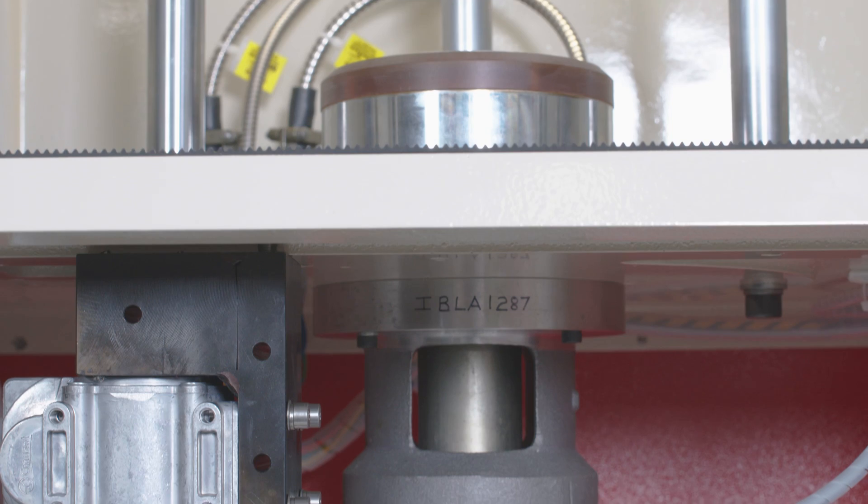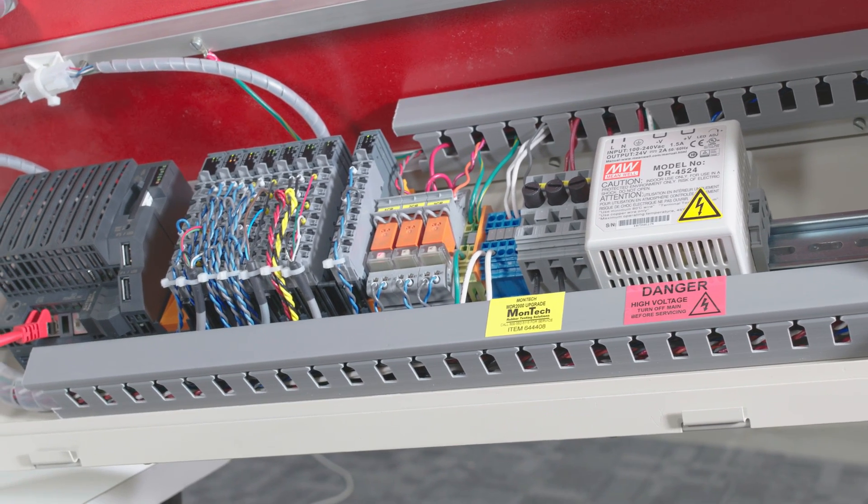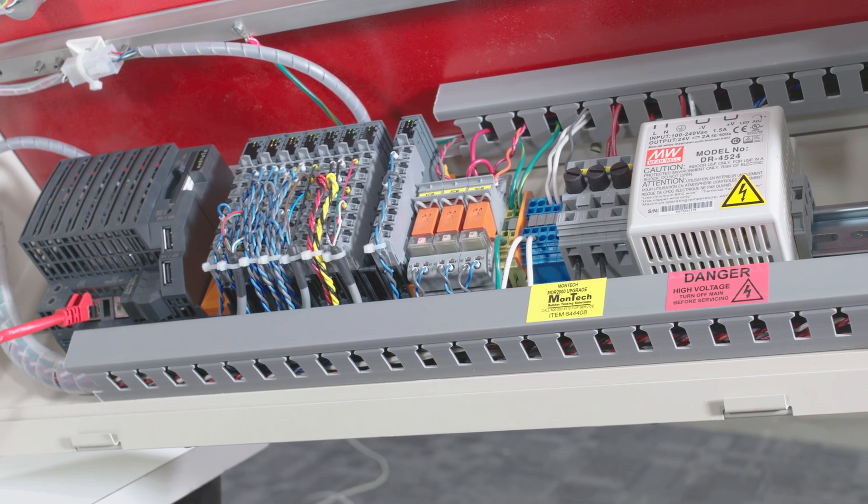The central shaft assembly is checked and new bearings are installed. Old circuit boards and ribbon cables are replaced with a new state-of-the-art Montec PLC and new wiring.